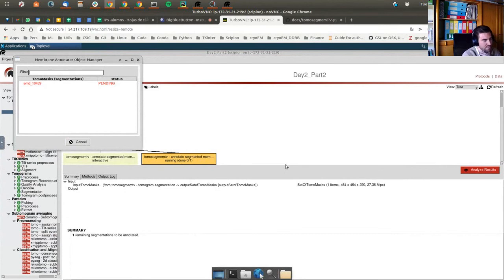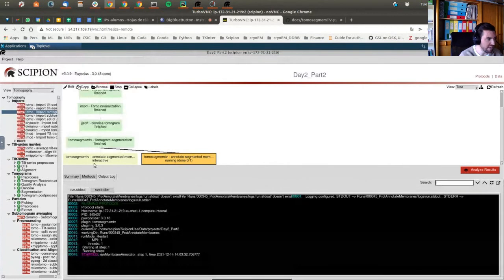Can we maybe confirm to you if we can follow you? So if the same step works also for us? Sure. We're going to carry it out slowly because it's break time. Anyone who has reached the final point can go there, and the ones who have not, please stay here with me, and we'll try to do it. And if not, we can take the result from the whole project. But I would like to have all of this done.